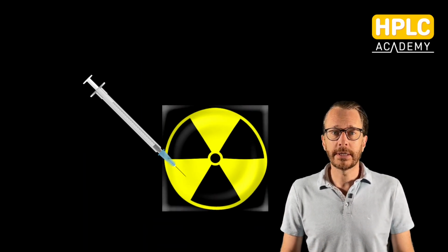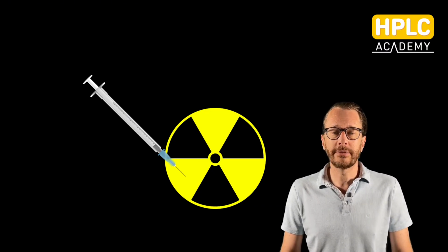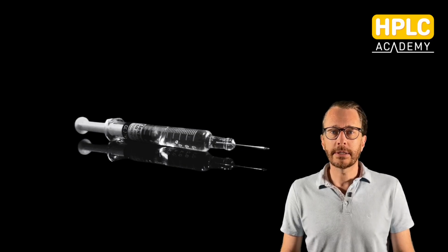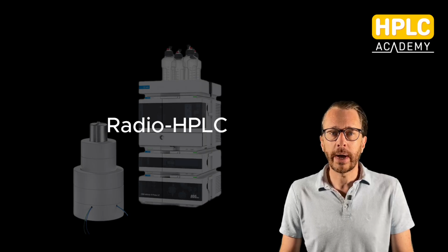Let's start. Every day, in hospitals and research centers around the world, patients receive radioactive drugs. Before any radioactive drug reaches a patient or enters a research protocol, it must pass a series of quality control tests. One of the most important of these tests is performed using a technique called radio-HPLC.